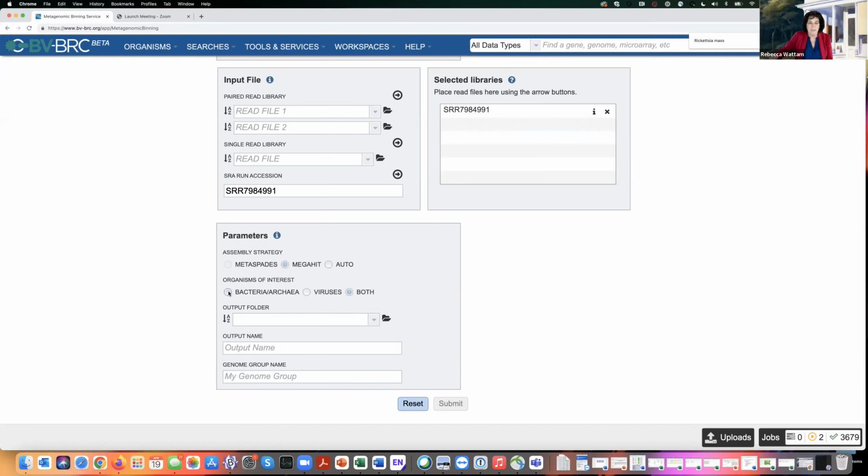In this example, I would encourage you, you know what? I do everything when I do these things, especially when it's my data and I'm moving toward publication. I want the very best assembly. So I'm trying everything I can to get the best assembly, to get the best results. So I would encourage you to do that too. And believe me, I've done everything with this.